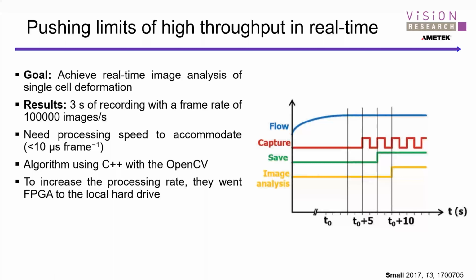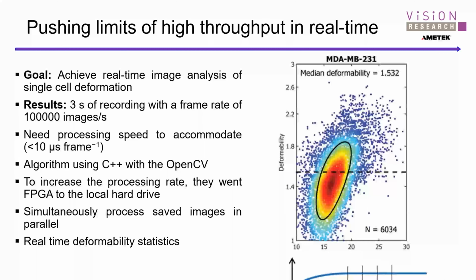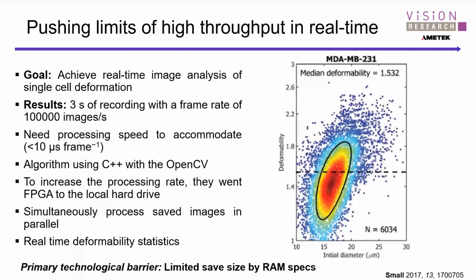The camera can completely be controlled by C++, Python, or LabVIEW, or whatever you wanted to control it with. And then they utilize an FPGA to a local hard drive just to optimize the processing rate of the data coming off. So that can all be done, right?